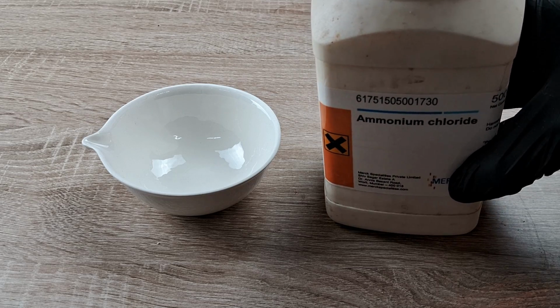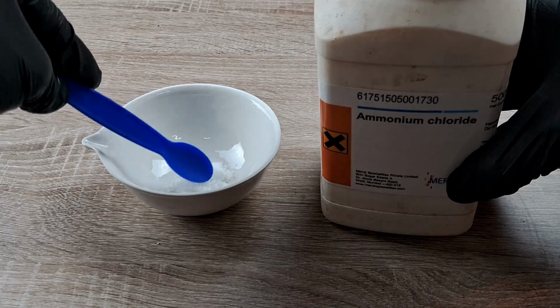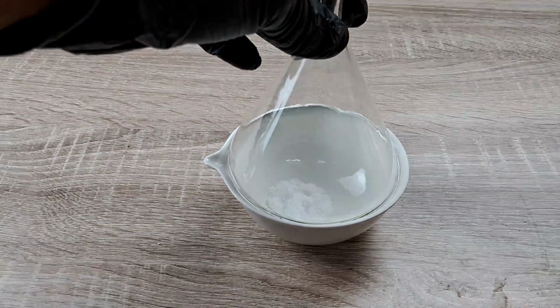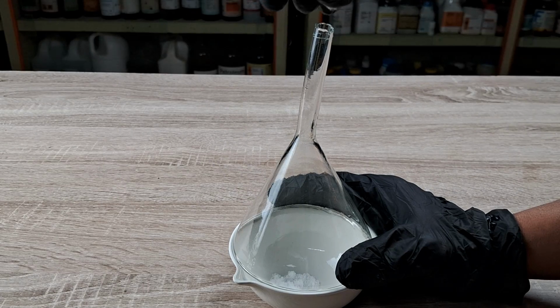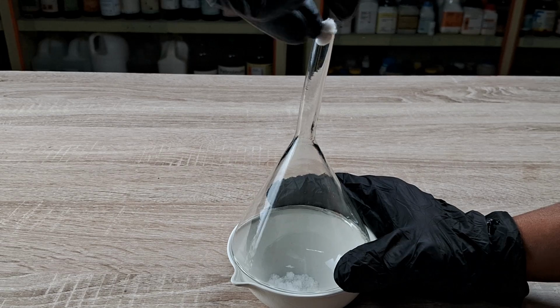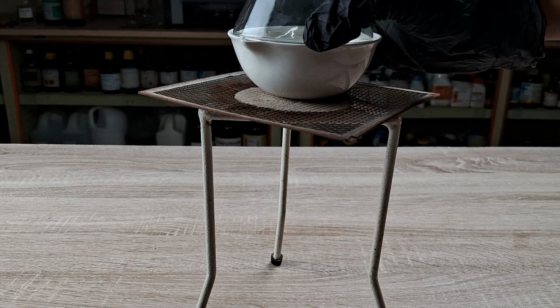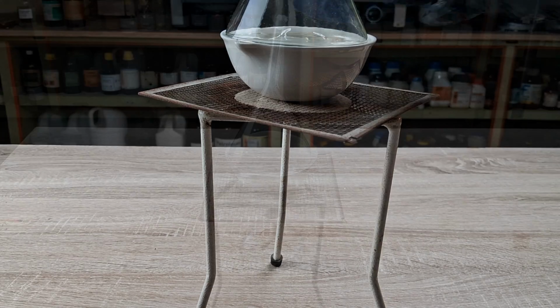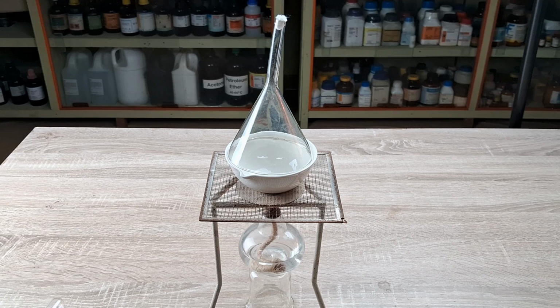Procedure: take a spatula full of ammonium chloride in a clean and dry china dish. Place a clean and dry funnel inverted over the china dish. Plug the open end of the funnel stem loosely using a piece of cotton or glass wool. Place the china dish on a wire gauze on a tripod stand. Once the setup is ready, begin heating the china dish. Record your observations.